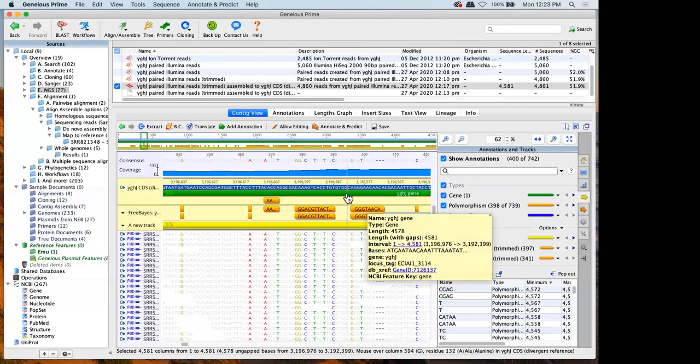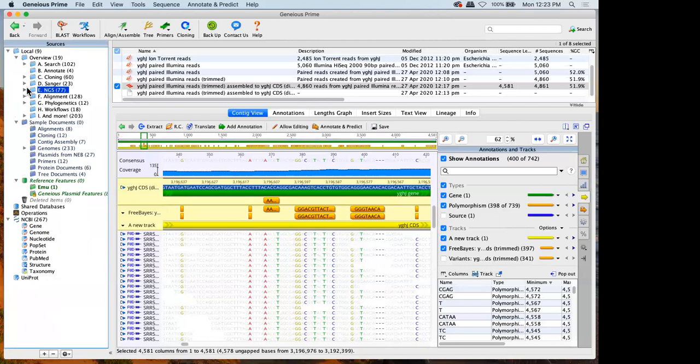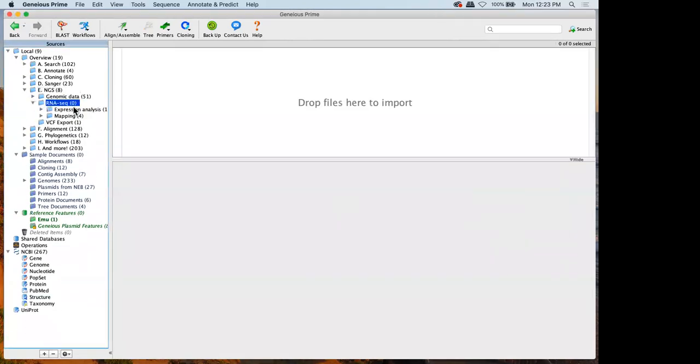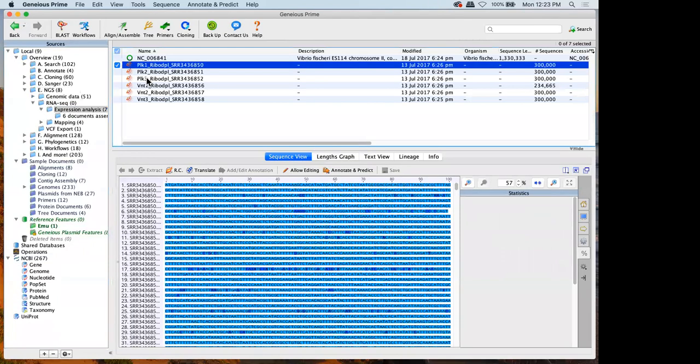Okay, question on DESeq2. Yes, Geneious does, like I said earlier, allow you to do basic RNA-seq analysis. A lot of that process is very similar to what we've just done. So let me grab some data here. If you're working with RNA-seq data and you want to do expression analysis, it's a very similar process. I've got my NGS data.